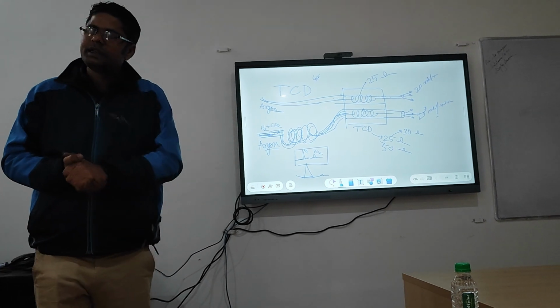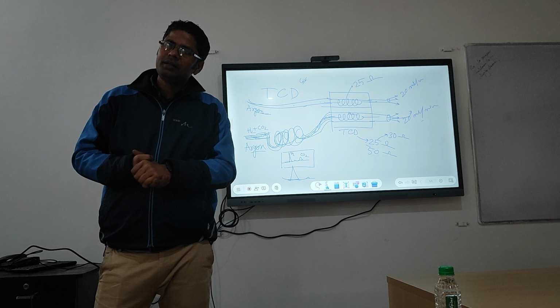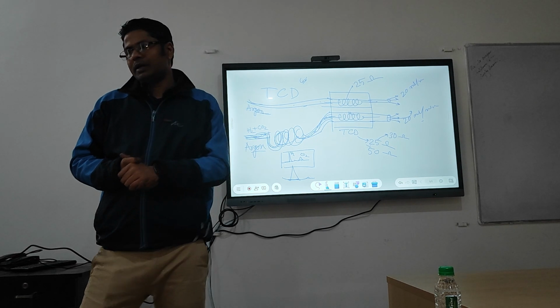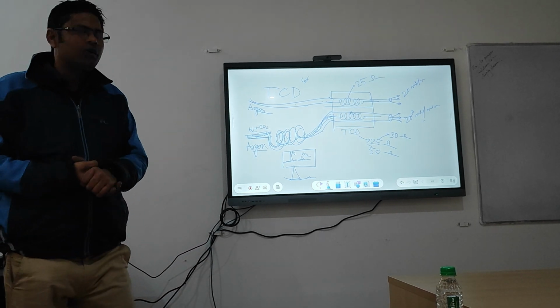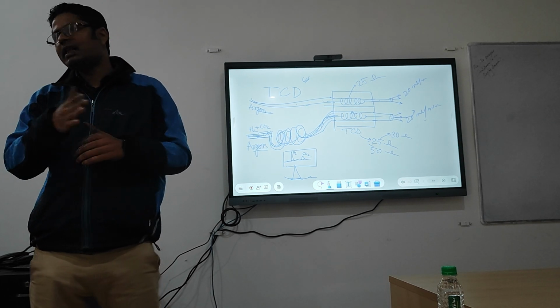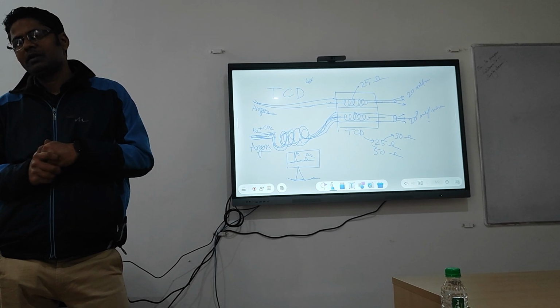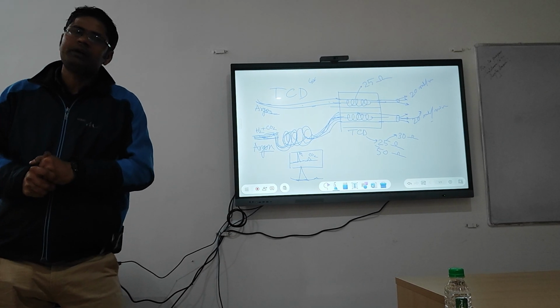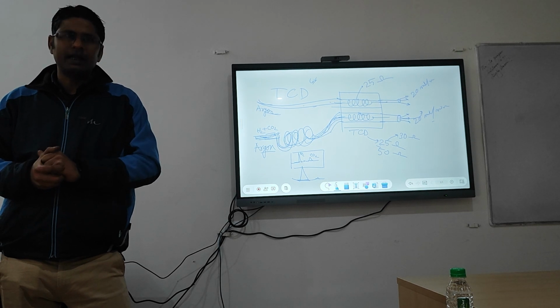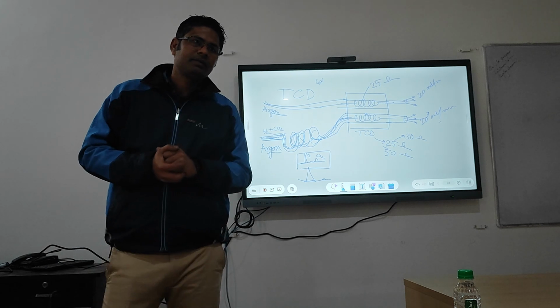Of these 4 gases, helium is very costly, but if you use helium, you will definitely get a very good peak, because helium's thermal conductivity is very different from that of any other analyte. So you will get a very good response. Still, it is not a very responsive detector, because it works on the principle of thermal conductivity.